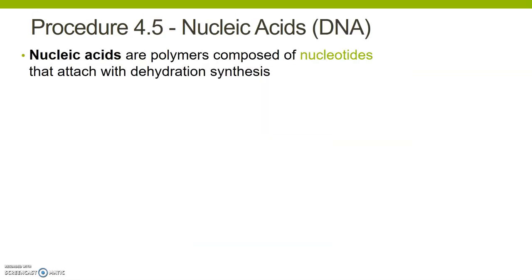So the last of the procedures you're going to do in this lab is looking for a specific nucleic acid. So I said earlier, nucleic acids are not something most people have heard a ton about as a category, but you've all heard of DNA, and DNA is a nucleic acid. So in this test, we're actually going to be looking for DNA.